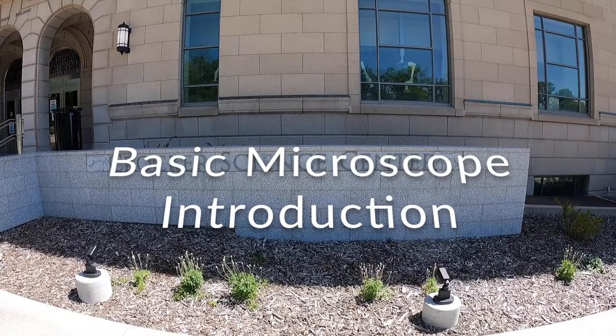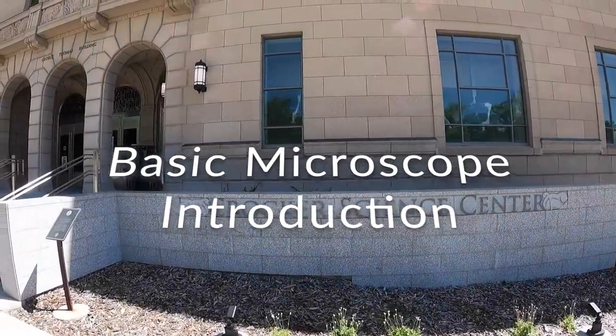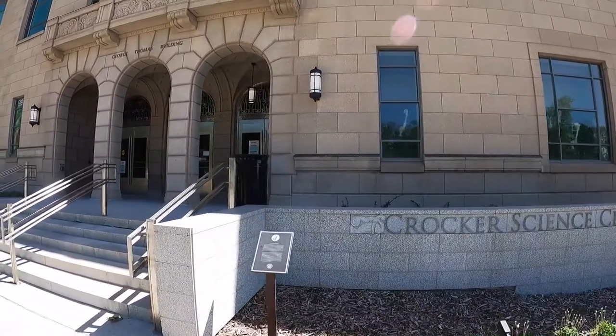Welcome to the Crocker Science Center Educational Labs. In this video, we will be covering the basics of operating a microscope.